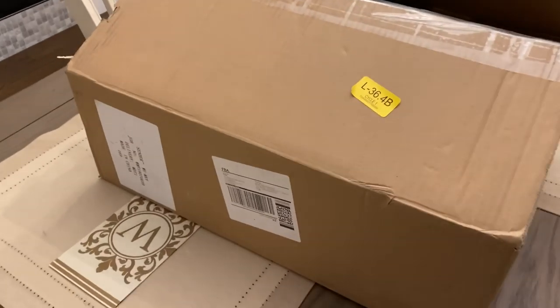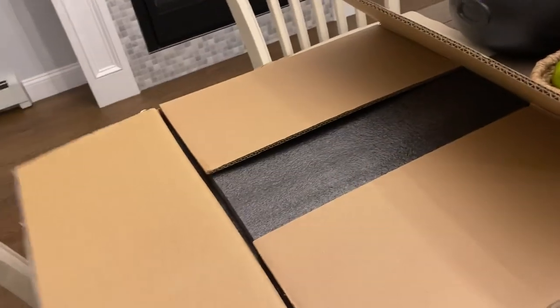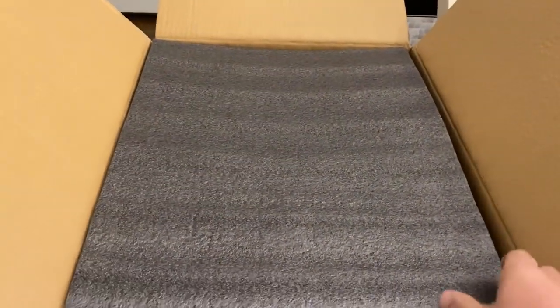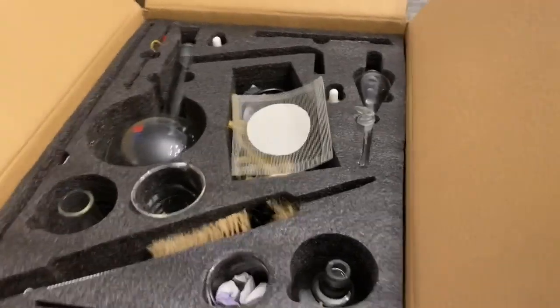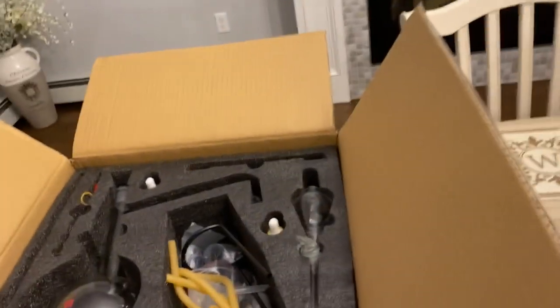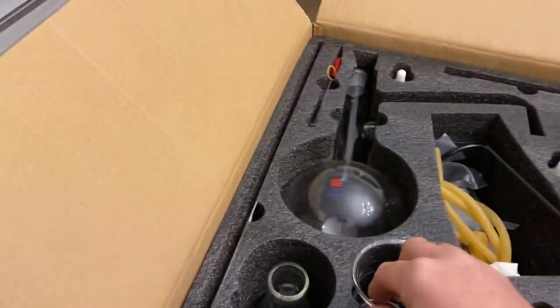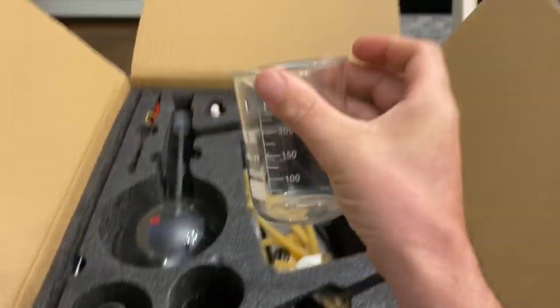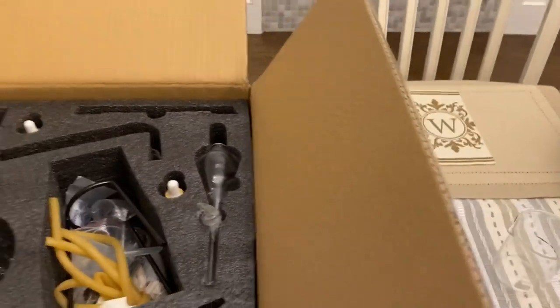Here's the box that we received — this is the box we also sell and ship. This is the actual glassware system. We'll be doing an unpacking; it comes with a list of your items. In a future video we'll show you exactly how to use this. It comes with a reflective heating element — it's all very good quality glassware.